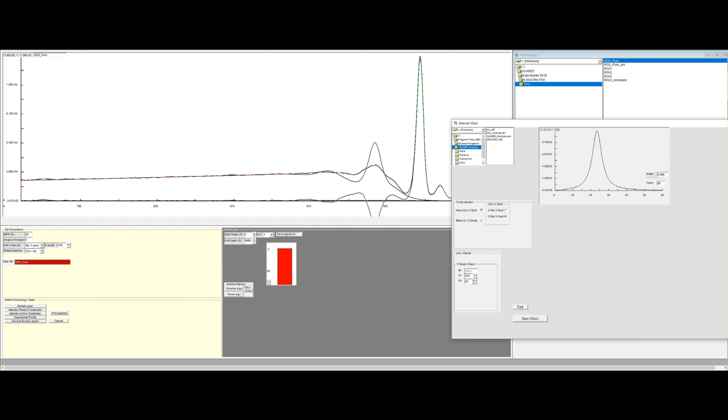We can also vary the width of that. We do that by the parameter D. So we increase that, the width increases. We can maybe move that up to a couple of hundred here, and now the width is more or less correct. We can move the position a little bit further in, so we have a good account for the structure here. We get a smooth background corrected spectrum in this range.